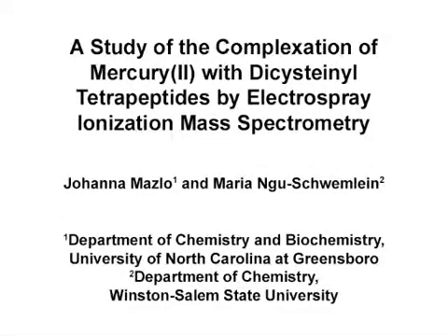The overall goal of this procedure is to prepare complexes of mercury and dicysteinyl peptides under different reaction stoichiometries and to characterize the different complexes formed by electrospray ionization and orbitrap mass spectrometry. This method can help answer key questions regarding the complexation tendencies of mercury and thiol compounds, which will enhance the rational design of chelating agents for sequestering mercury ions.